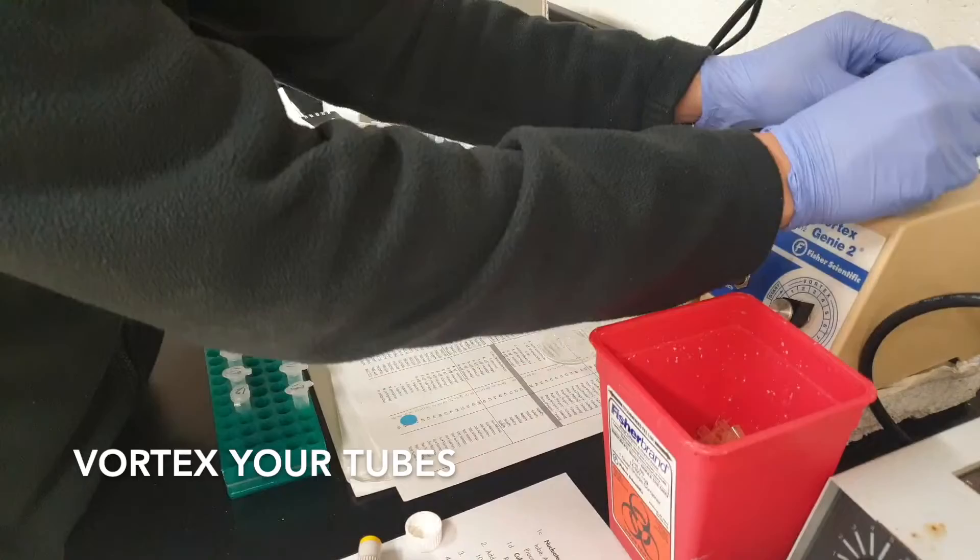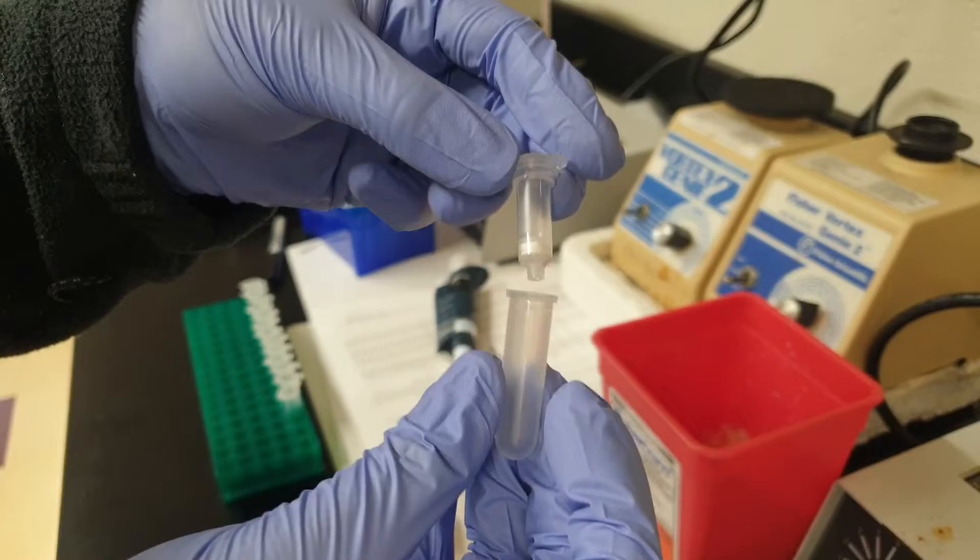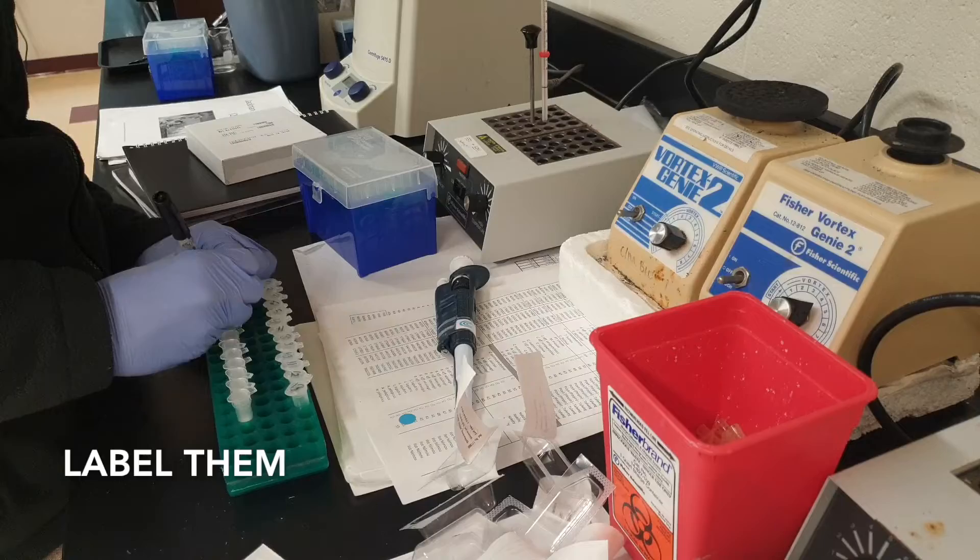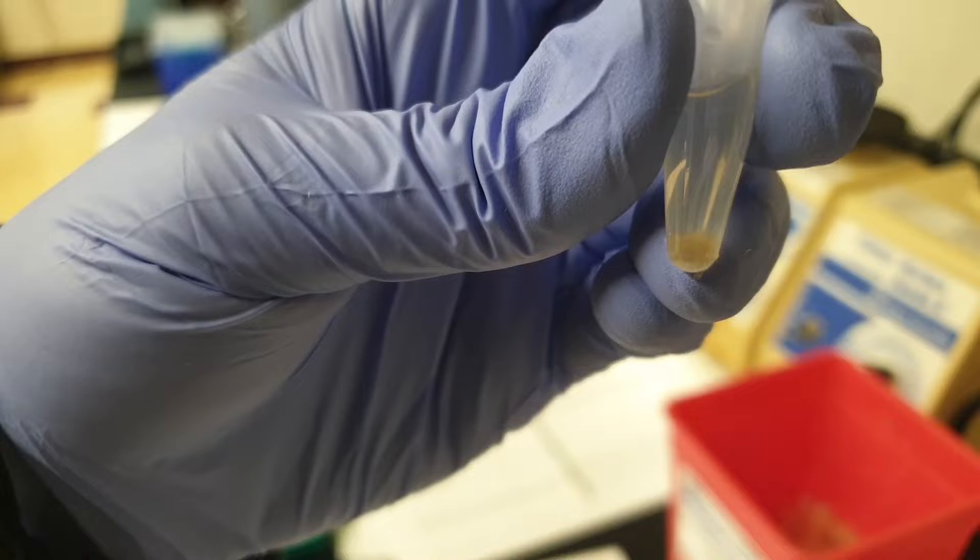Vortex it, then grab your spin column tubes and label them. Transfer all 600 microliters of solution that's in the 1.5 ml tubes into the spin column tubes that you just opened from the kit you received.